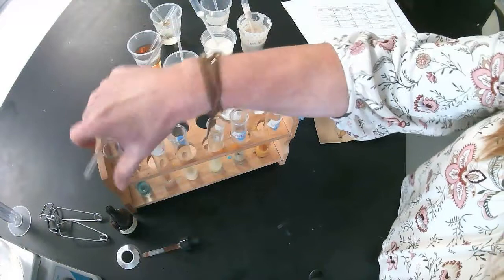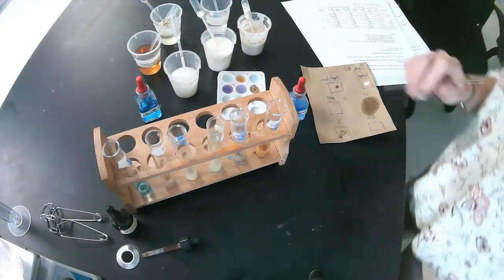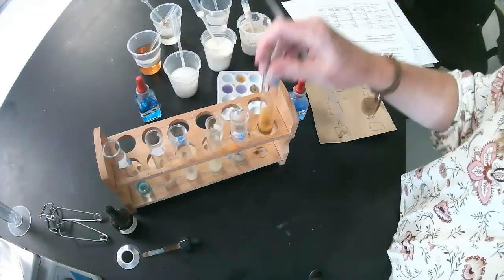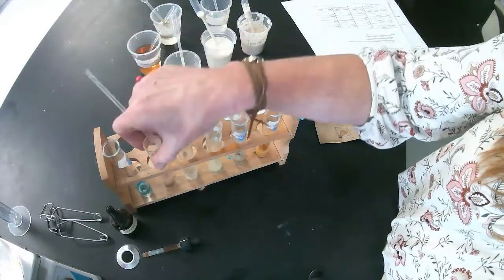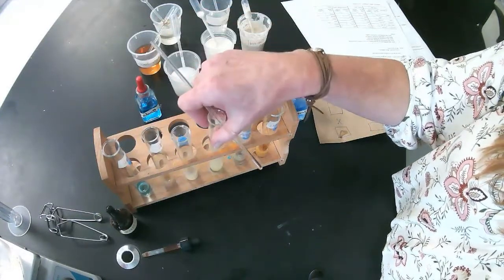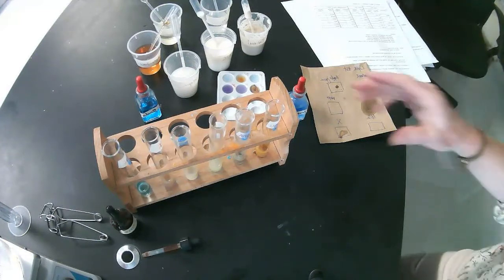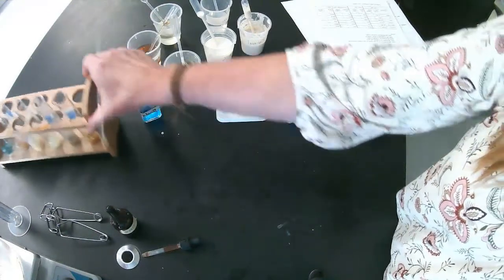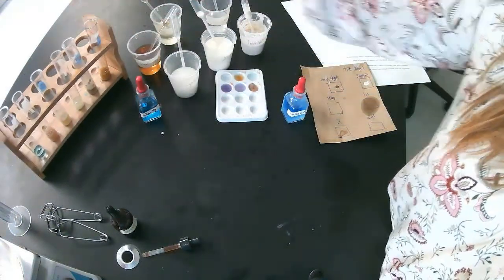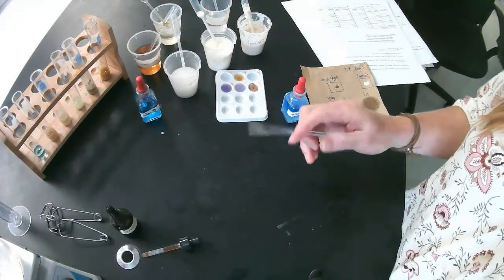So okay, the only one really positive on that one is going to be the apple juice that went really brown. I think these other ones went brown because they've been sitting for so long, or I overcooked them. So again, juice, brown color from the Benedict's means that it's positive for sugar. Okay. And then the last one.